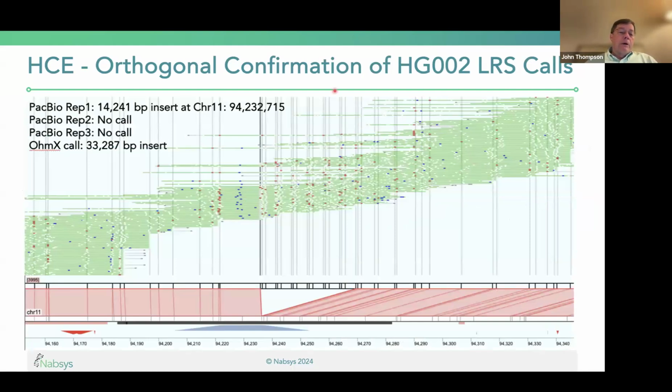If you look at the PacBio data on their website, they had 3 technical replicates. And so we looked at some of the variants that disagree in terms of calls. About 10% of the variants among these 3 replicates do not agree among all 3. So that means that 90% obviously do agree. So those are pretty likely real, but you have quite a few that are not.